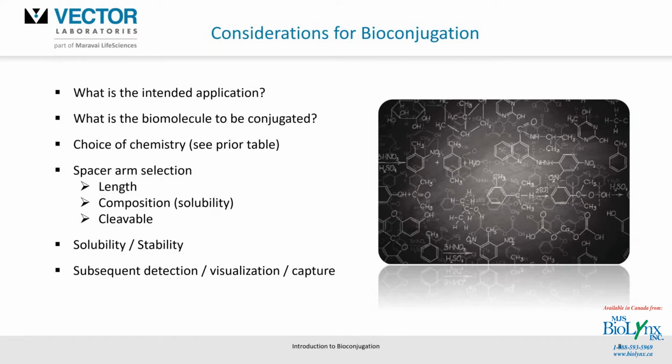But I think you'll find pretty quickly that there are a number of other considerations that you'd have to take under consideration, such as pH, buffers, salts, things like that. How are you going to purify it as well? That may not be readily available. It may be expensive to do or a little complicated. So we're going to have a look at some of the kit formats coming up here that I think would be a great way to introduce yourself, or indeed a lab member or your lab, to bioconjugation.